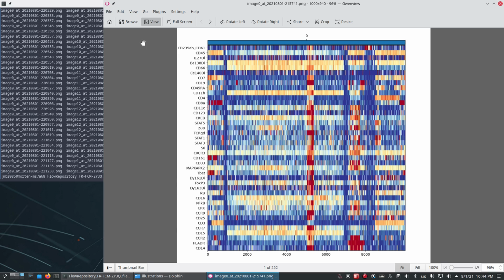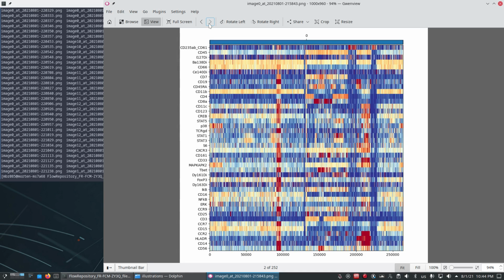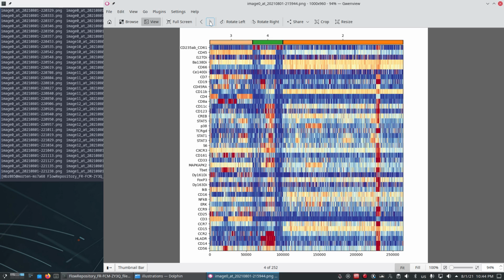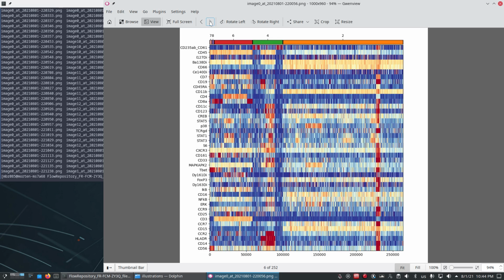So now I'm going to go up, and we can make a quick run through of the images. Here we have the events ordered, but no clusters, or only one cluster. Then, something happened. This is unfortunate. That's just noise. This is the same again. Next one. Here we split once. And then I split once more, and once more, and once more. Oh, I unsplit. Yes, I decided to not split. So you see, I merged these, but the number goes up from 5 to 9. I didn't like the split I made, so I split differently, and now I split very small pieces, you see.